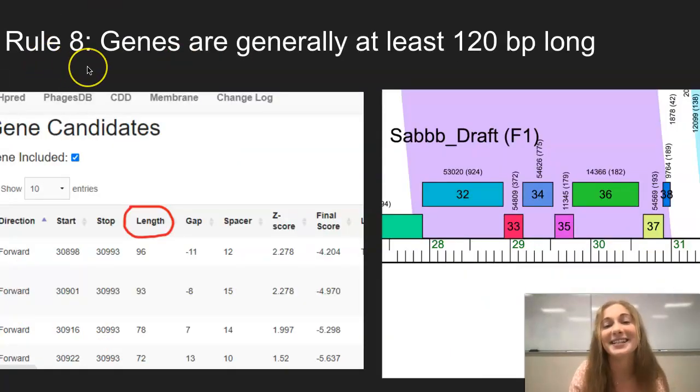Rule 8 tells us that genes are generally about 120 base pairs or longer. On pecan, we can find the length of each gene in this column right here. As you can see, all of these options are below the average length of 120 base pairs long, which means that we should be considering deleting it.